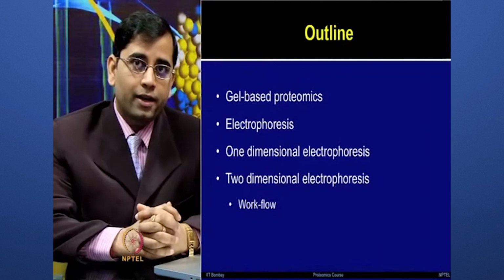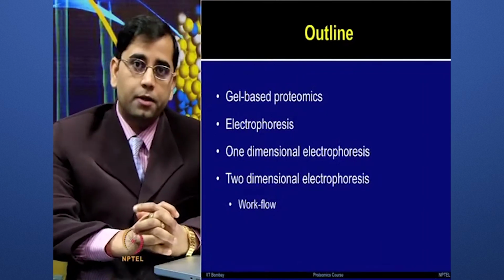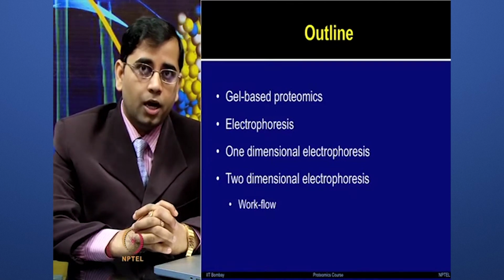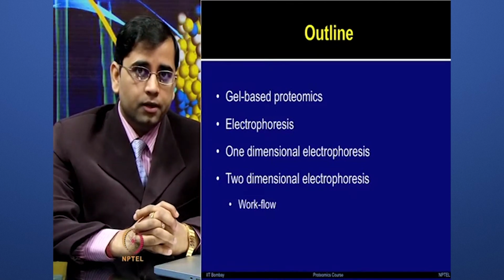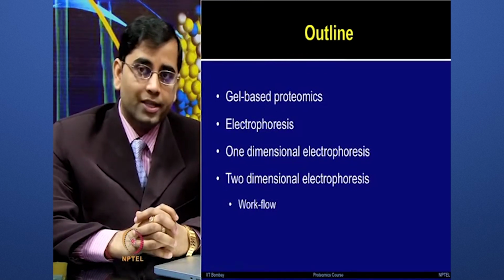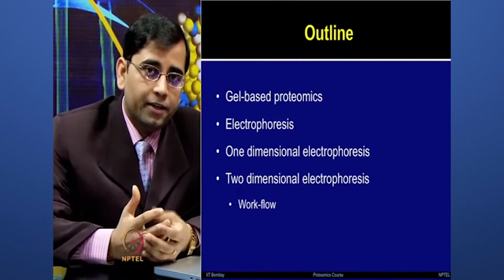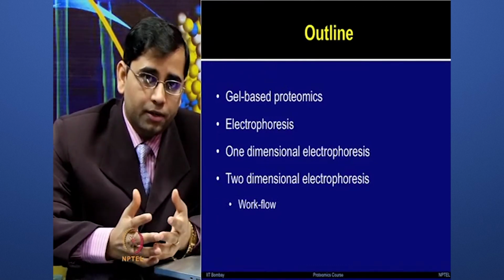So, let me give you an outline for today's lecture. I will describe gel-based proteomics, how electrophoresis is used, and different types of electrophoresis such as one-dimensional electrophoresis or SDS-PAGE, which is used to separate simple protein mixtures.